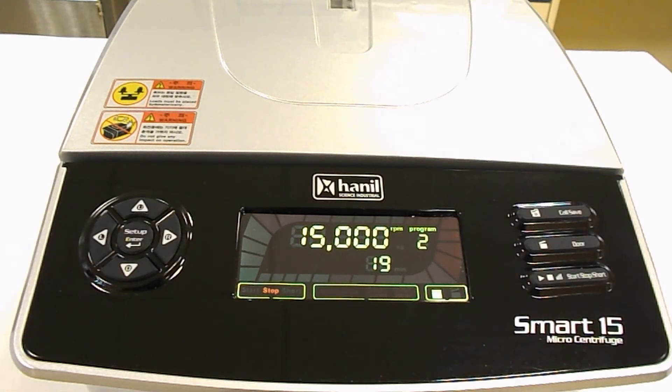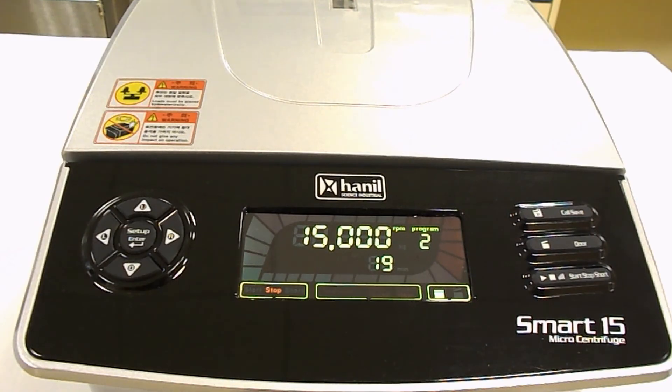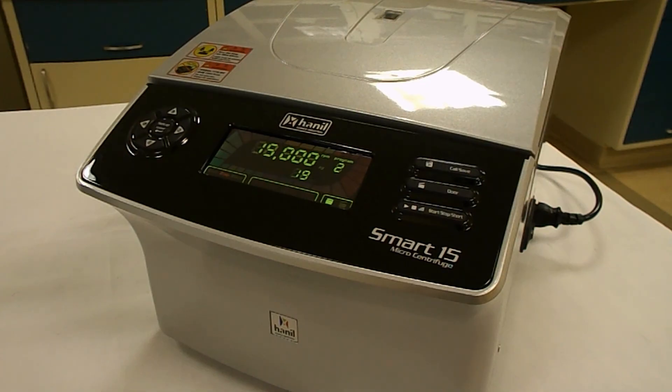Since we consider the Smart 15 a high-end centrifuge, Hanil was really keen on including as many safety features as possible. These include a rotor imbalance detector, over-speed sensors, door latch sensors, and an overheat detector for the DC motor. These features not only help protect you during experiments, but also help reduce wear on critical components of the machine. And that's the Hanil Smart 15 Microcentrifuge in a nutshell.